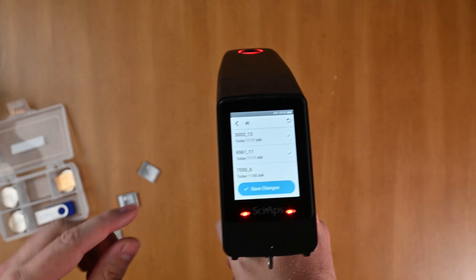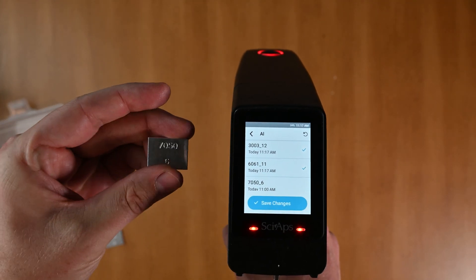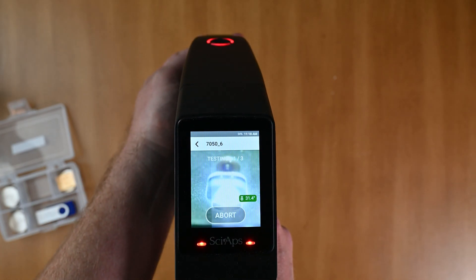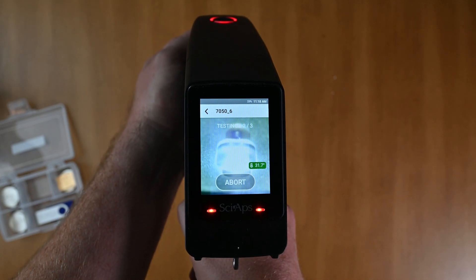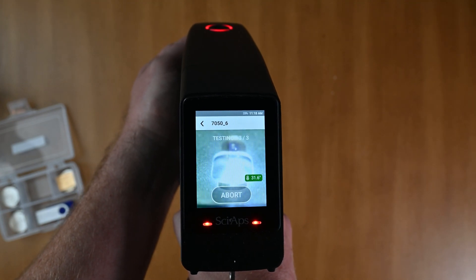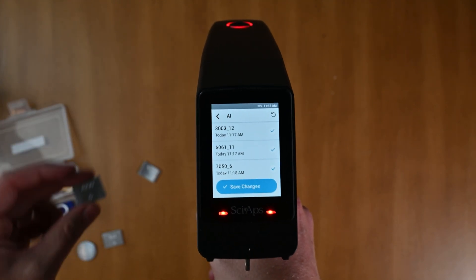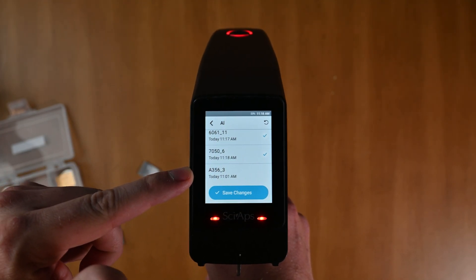If you're struggling to get good results, you should always try to clean your analyzer first. LIBS analyzers are really sensitive to surface finish and cleanliness, so make sure you're grinding your sample clean, that your sample is flat, and that you don't divot the sample with what you're grinding it with — that would cause it to run funny, and no amount of drift correction can help that. 7050 is done — we've got that checkbox — and now I scroll down to A356, which is up next.